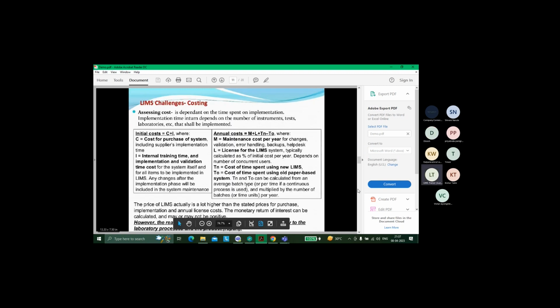So that's what, right? But however, see what is written. Oh, this 74% came in the middle.